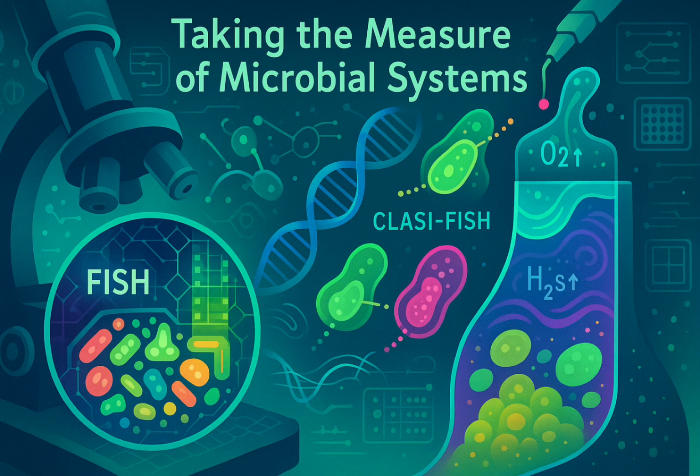Right. And then there's flow cytometry, which is much faster, much higher throughput. How does that work? It shoots cells, single file, through a laser beam, and it measures how they scatter light or if they fluoresce naturally or with a stain. Based on those signals, it can physically sort cells into different tubes, thousands per second. So you can separate specific types from a huge mix? Exactly. Very quickly. You can sort populations based on size or maybe fluorescence if you've tagged them somehow.